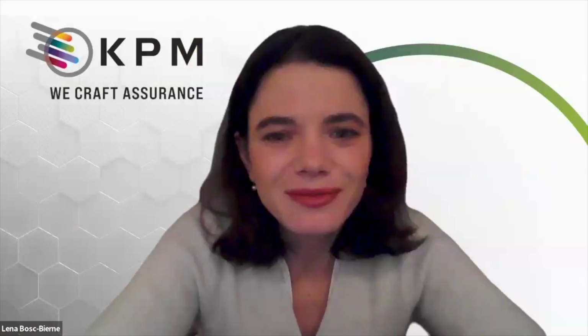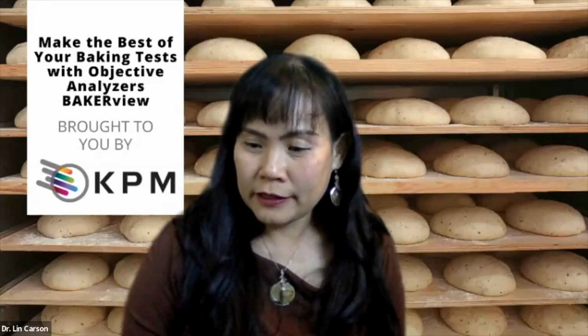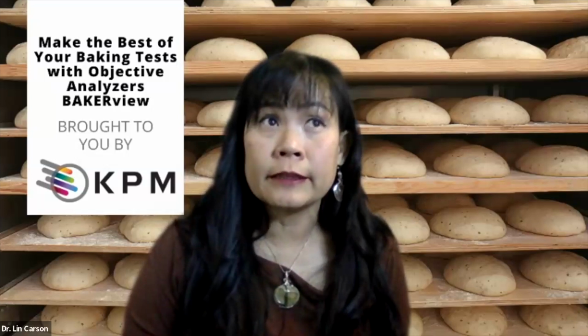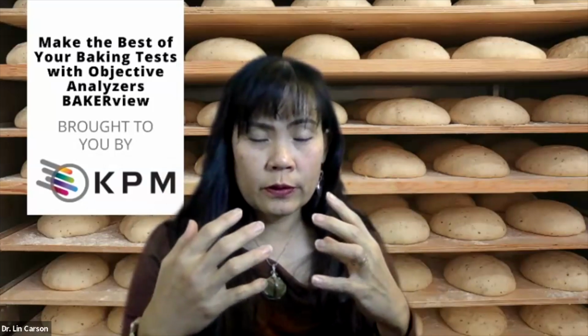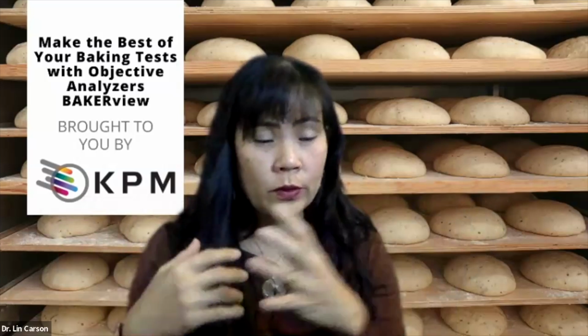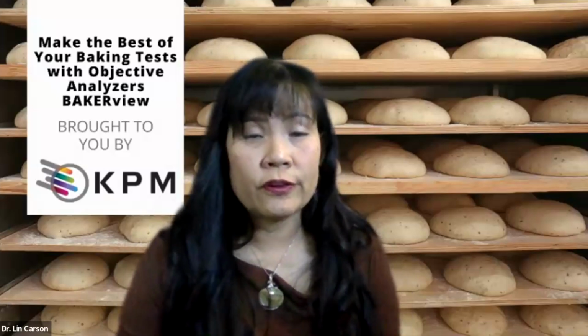Yeah, this is a very versatile equipment. As long as you don't work with a liquid dough, then you're good to go. So I have something to say about gluten-free. Yeah. And I'm having a hell of a time trying to develop for this particular niche. The biggest issue is really to simulate a system that can hold in the gas, right? That is the biggest thing. If you have a particular formula or recipe that holds in the gas, that's key to any kind of gluten-free baking that you want to simulate a traditional product. And you can absolutely see it in the RheoF4 as well.